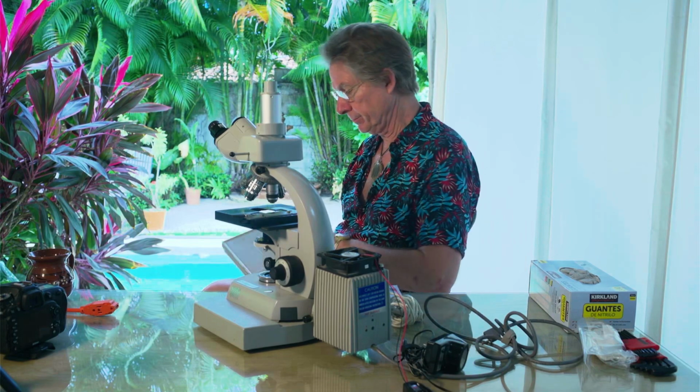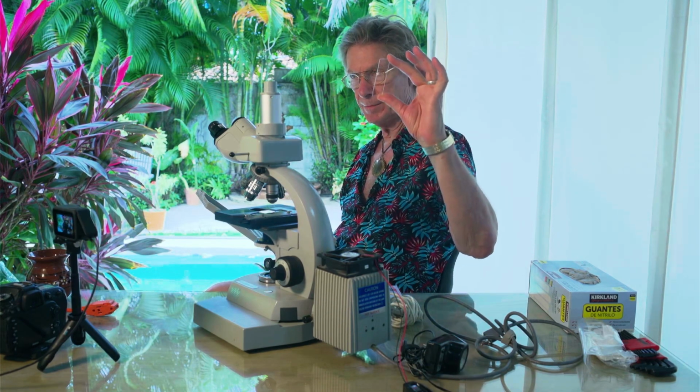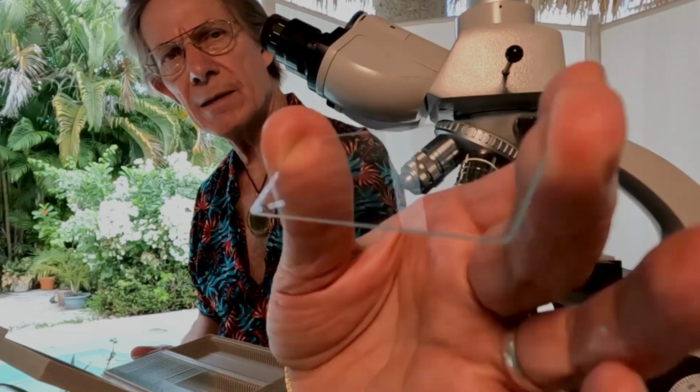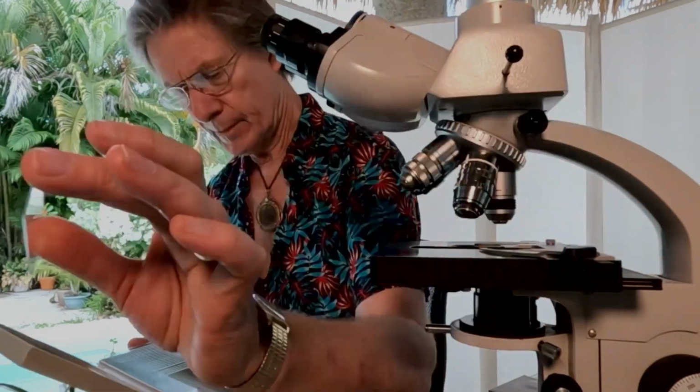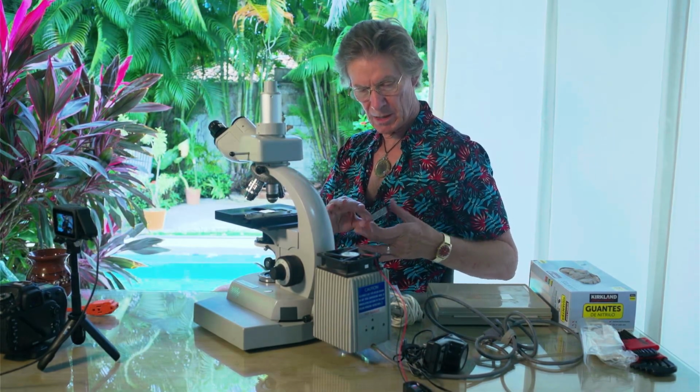Now, this is a slide box, and it contains, right now, microscope slides, and that's what they look like. We can hold it up really close. They are clear glass of a very specific size. And when you buy microscope slides, they come in a box like this.